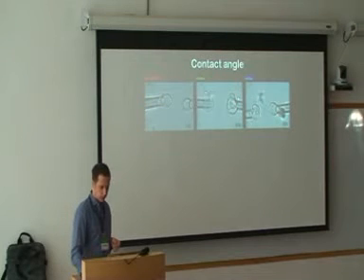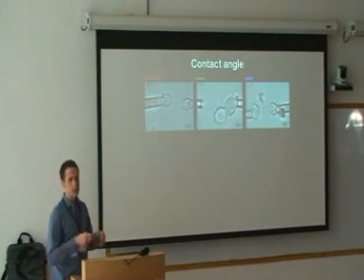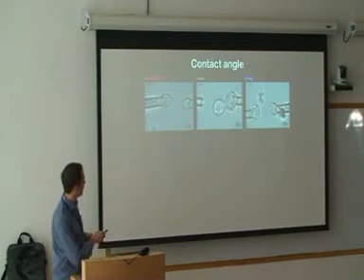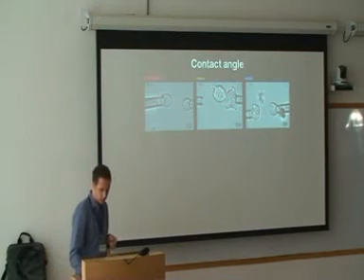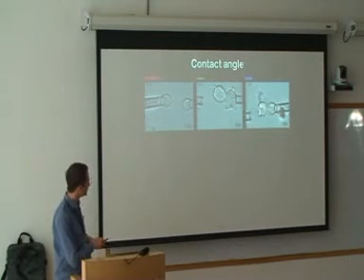And we have done that for ectoderm, and we have done it for mesoderm as well. The way we get these progenitor cells is by taking embryos which are expressing GFP in different progenitor cell types and isolating these single cells. This is a mesoderm one. You might already be able to see that they're forming a slightly smaller contact, and endoderm cells usually form a very, very small contact.